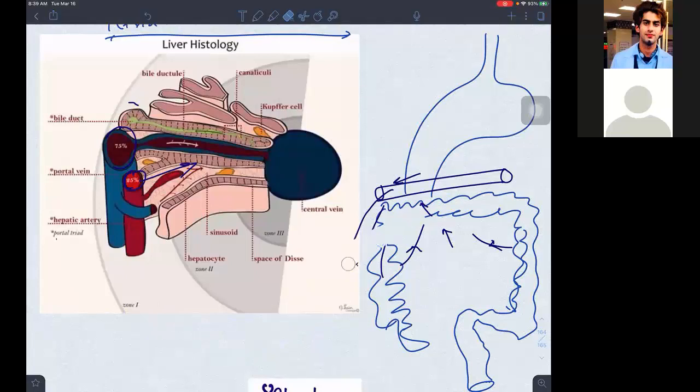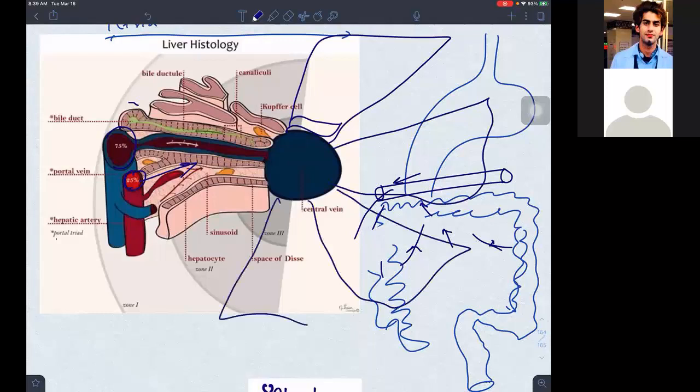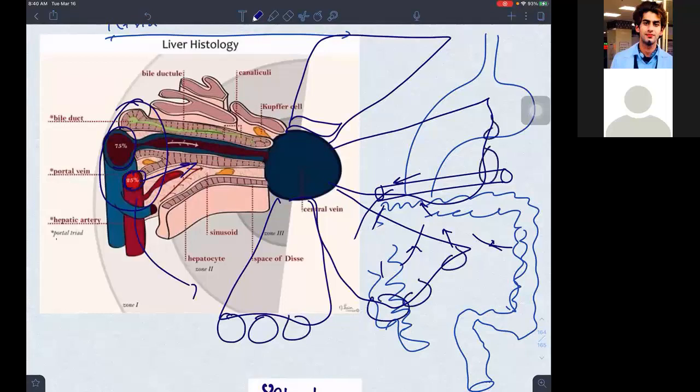So see, my dears, now can we appreciate that on every end there will be the same design, arranged in a hexagonal manner. Can I see on every point these three things? 1, 2, 3. 1, 2, 3. Can I see it on every point like this?